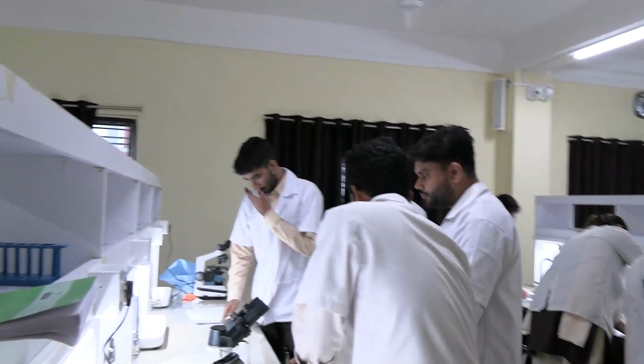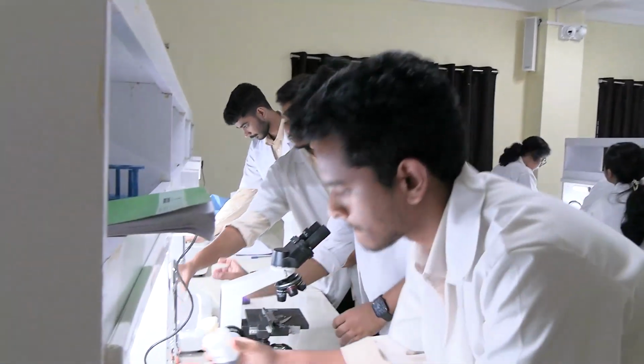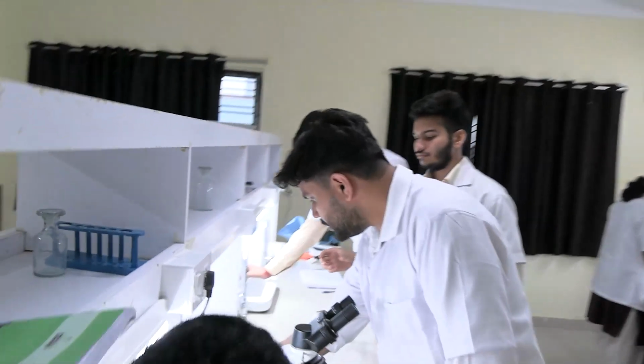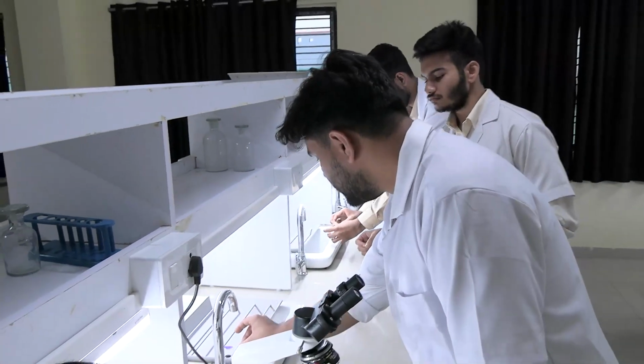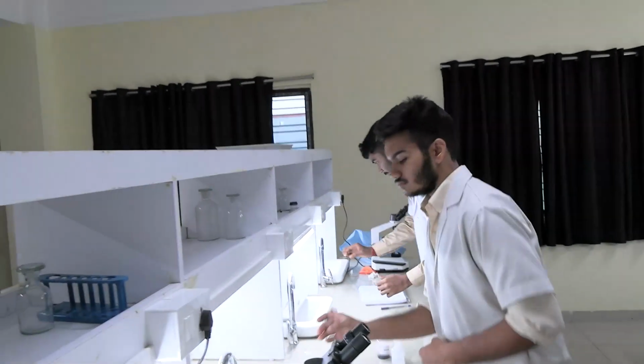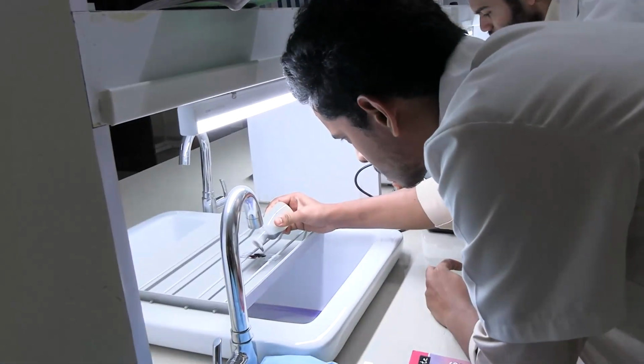Is your time over? So you need to wash now. You're gonna hold it like this, you see? You take it from here, okay? And you hold it like this, okay? Then you can wash. Hold it and wash. Okay. I think that's enough.